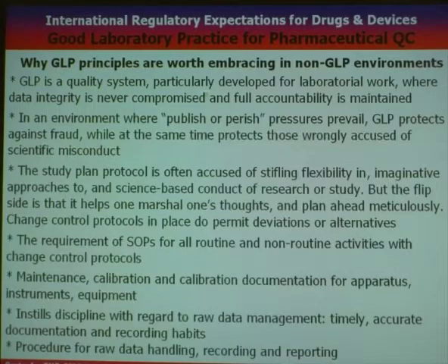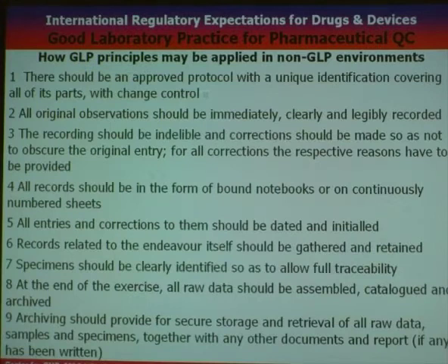The requirements of SOPs for all routine and non-routine activities with change control protocols, maintenance, calibration and calibration documentation for apparatus, instruments and equipment. GLP instills discipline with regard to raw data management, timely, accurate documentation and recording habits. Procedure for raw data handling, recording and reporting. So here we see how GLP principles may be applied in non-GLP environments.